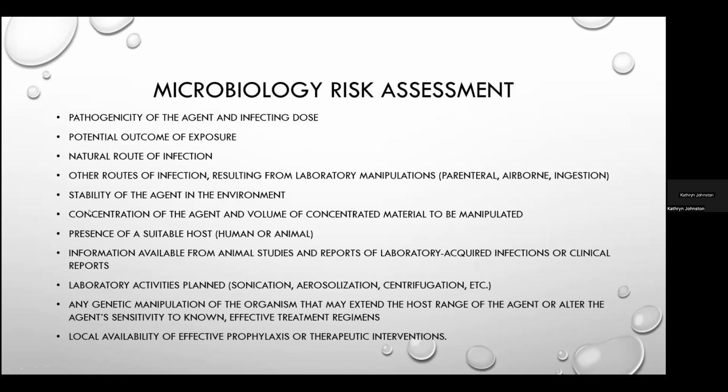And then also, what happens in the laboratory? Do you have specific persons that work in your laboratory areas that are at higher risk? Somebody who's recovering from cancer, or somebody who has some type of immune irregularity or something like that. And then, like I said, what types of laboratory activities do you do in that laboratory area? Do you do sonication? Do you do aerosolization? Do you centrifuge?